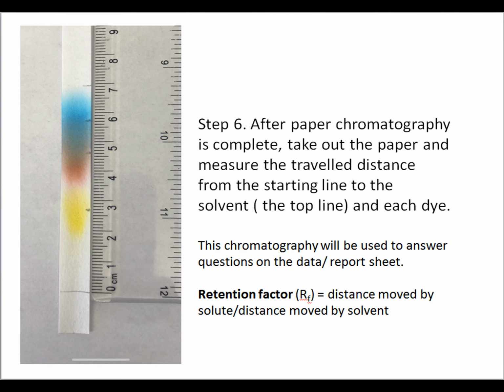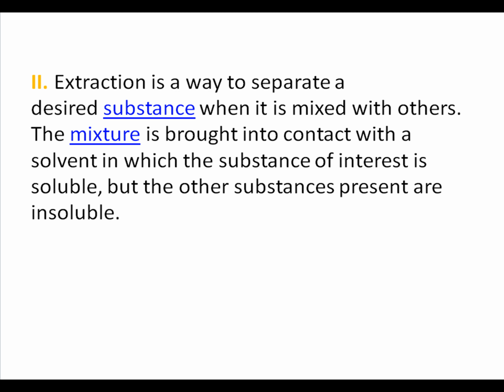Now we're going to move on to extraction, which is a way to separate a desired substance when it is mixed with others. The mixture is brought into contact with a solvent in which the substance of interest is soluble, but the other substances present are insoluble.